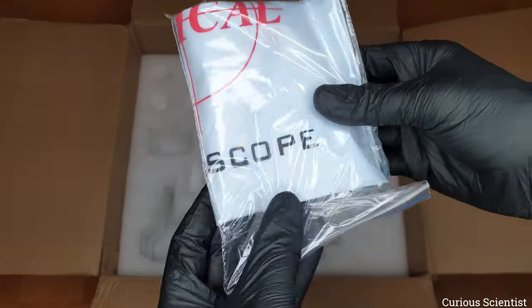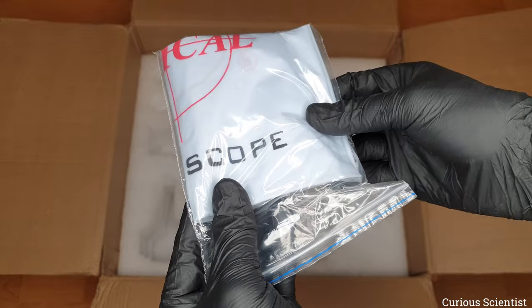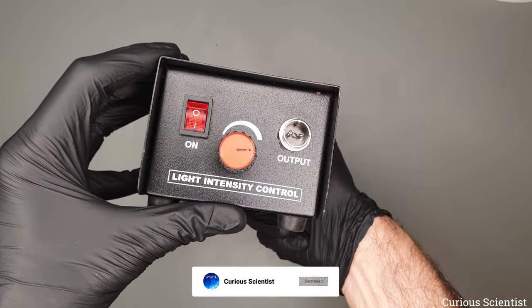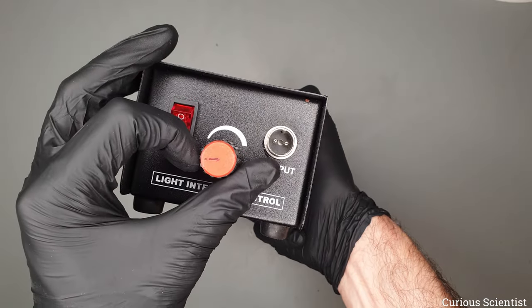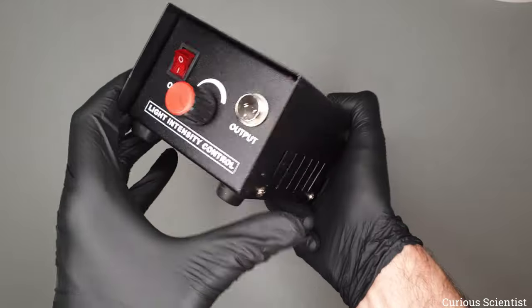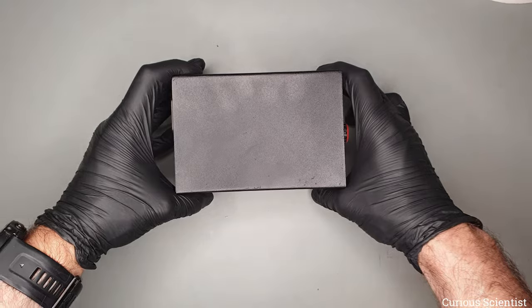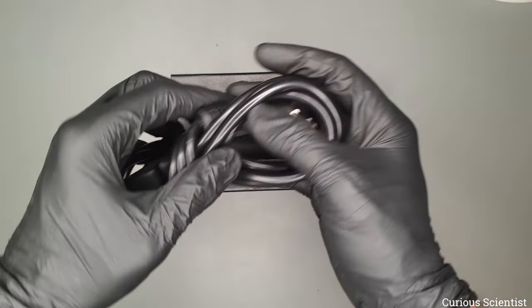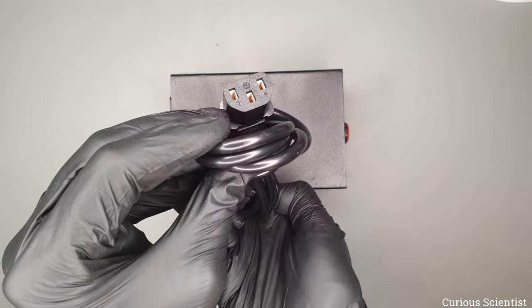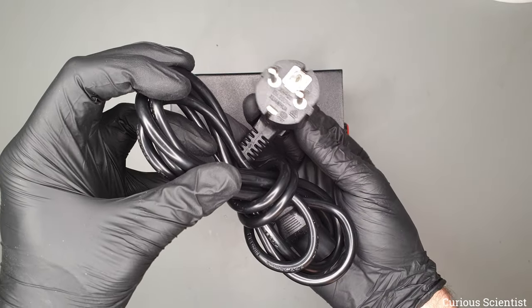The power supply for the light source has a potentiometer, an on/off switch, and a connector for the lamp. On the back side we have the main power cable — a normal power supply cable like you use for a computer, with an EU plug in my case.